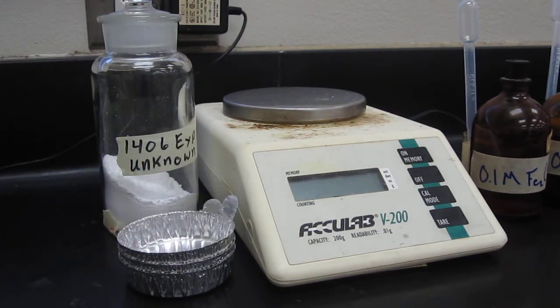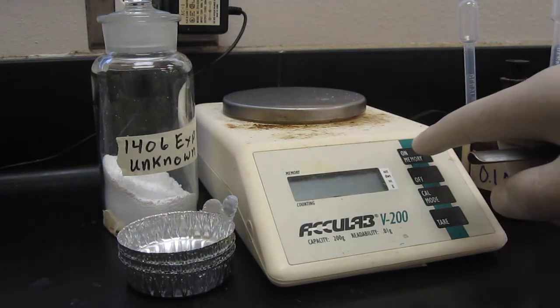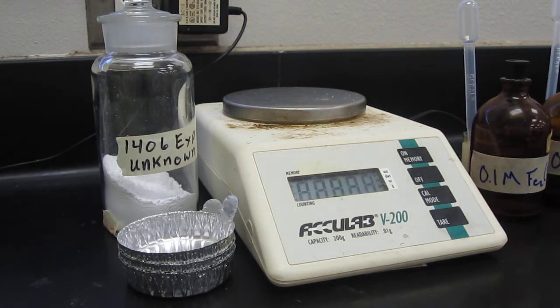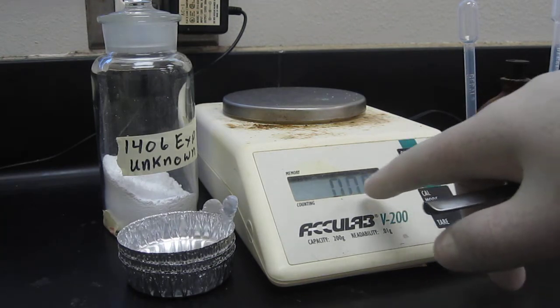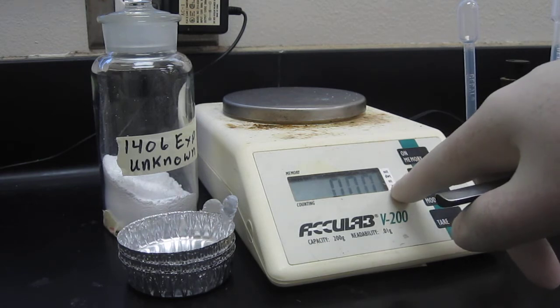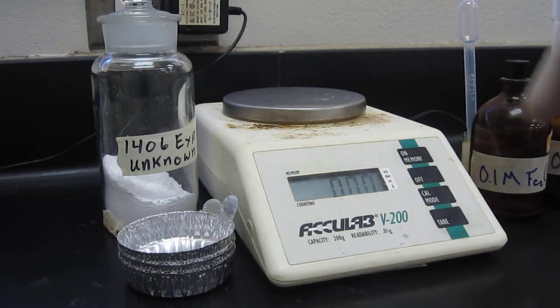The procedure calls for us to weigh 0.4 grams of our unknown, so we're going to demonstrate how to weigh something right now. The first thing we're going to do is go to the balance and push on, and you can see there that the balance is 0.00, and the arrow is pointing to the G there, which stands for grams.